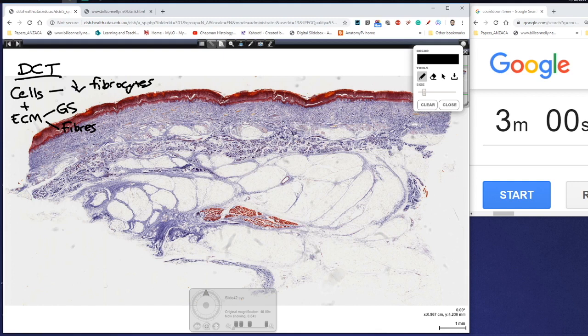So fibrocytes are the predominant cell type. In terms of ground substance, we tend to find lower levels of ground substance compared to loose connective tissue, but we do find higher levels of fibers, and they tend to be in bundles rather than individual fibers like we saw with loose connective tissue.